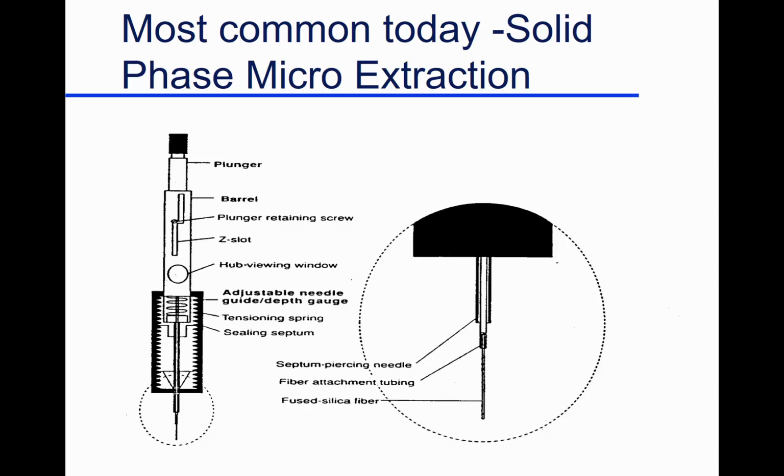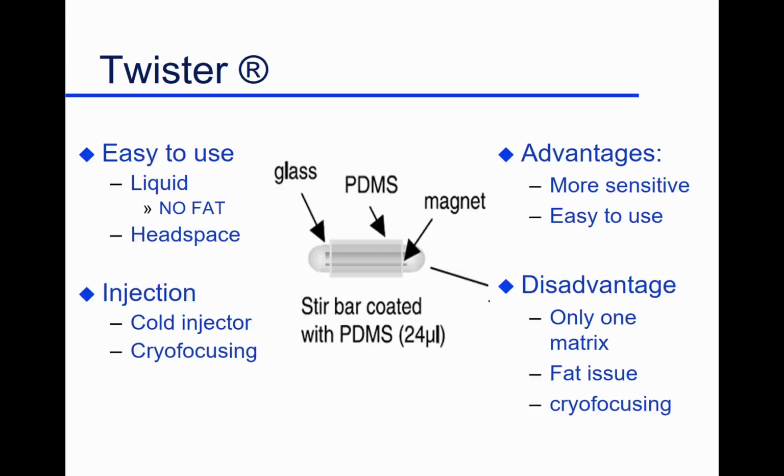So I may be interested in oxidation of wheatgrass. You could put the intermediate wheatgrass into a bottle, let it come to equilibrium, put this into the headspace of the bottle, and it will absorb any volatile compounds that have come from the wheatgrass. It keeps on absorbing, and pretty quick I get this well loaded. I pull it out, put it into a gas chromatograph, and push this down into the heated part, and it liberates the sample. So my sample is now free. A nice means of concentrating volatile compounds in a gas sample.